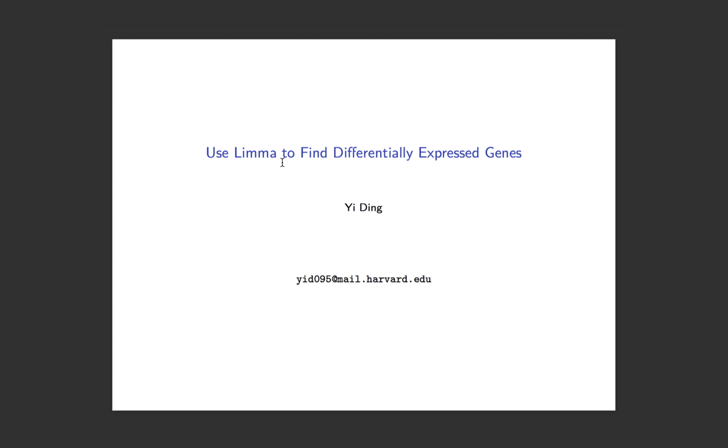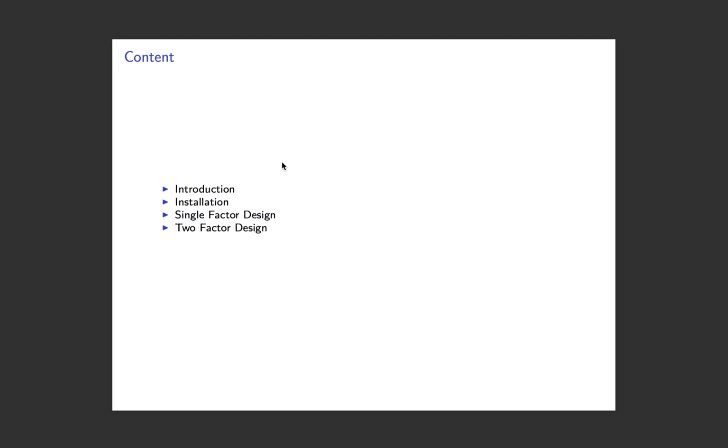In this video, I will introduce how to use limma to find differentially expressed genes. This video contains 4 parts: introduction to limma, installation of limma, and the last 2 parts are about how to use limma in different experimental design settings.